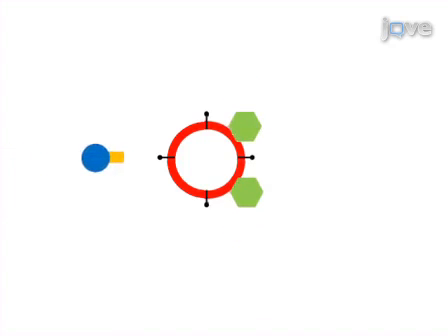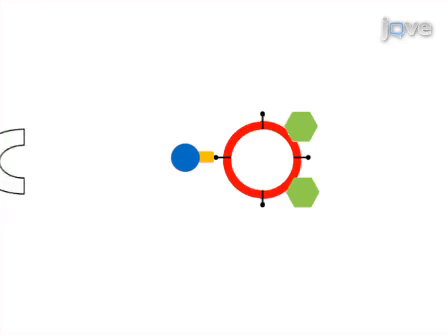The reaction mixture is then supplemented with Annexin V-conjugated magnetic beads to anchor the protein associated with the lipid vesicles to the magnetic beads. Next, protein-lipid vesicles are purified by magnetic activated cell sorting to identify the lipid-bound protein.